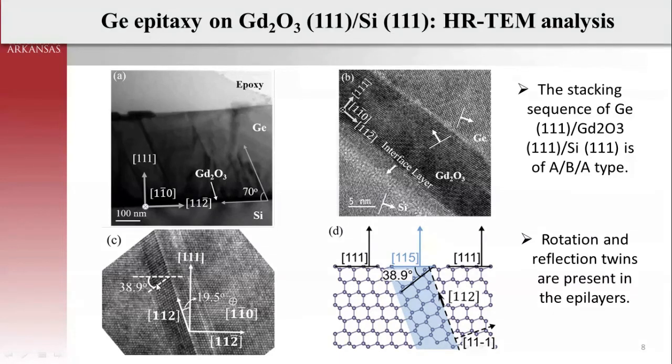This is interesting, isn't it? Really interesting. And in fact, this is what we have already got by using pole figure analysis. So the lamellar regions are basically 115 oriented 111 planes.